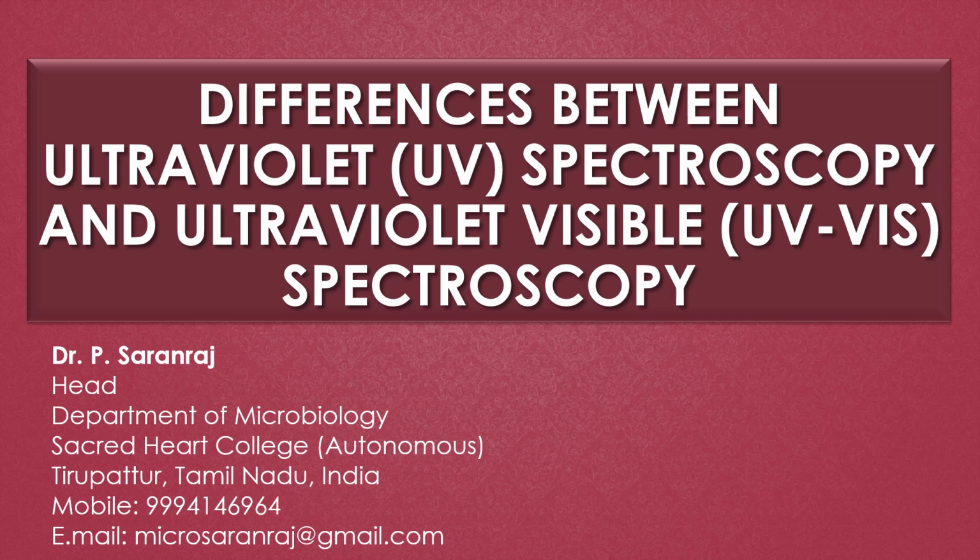Dear viewers, greetings. In this video, we are going to discuss the differences between ultraviolet spectroscopy and ultraviolet visible spectroscopy.